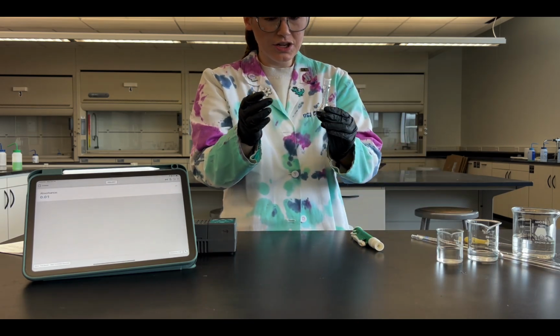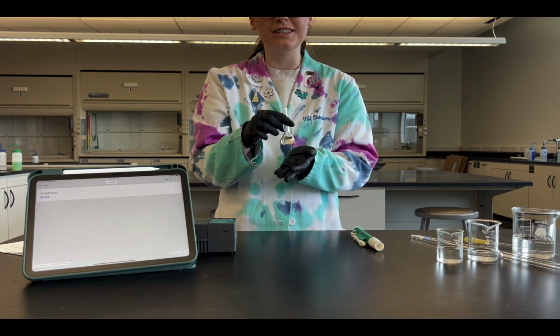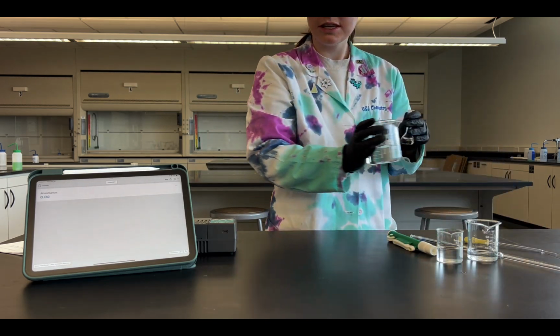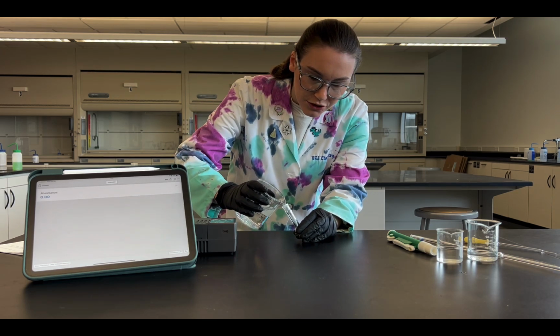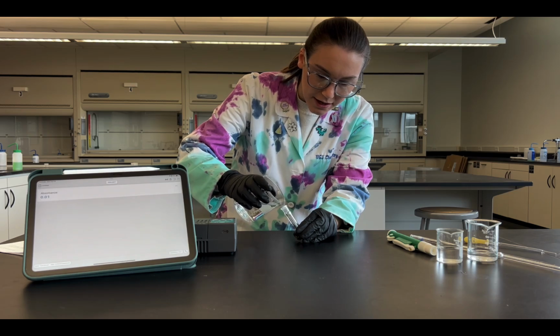So there's my solution. Because I'm doing smaller volumes and slightly different concentrations, it's not going to be as dark as my standard curve that we did in the previous part. So just keep that in mind. If you're doing this in person, they are going to look a little bit different. Okay, but then I'm going to use the nitric acid to fill the rest of the way.